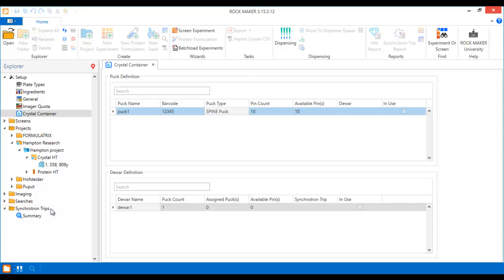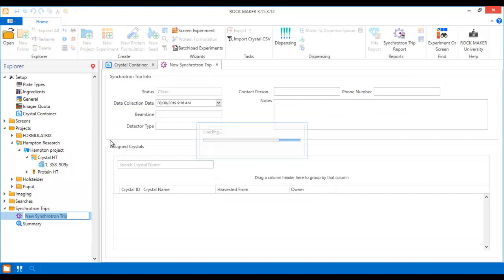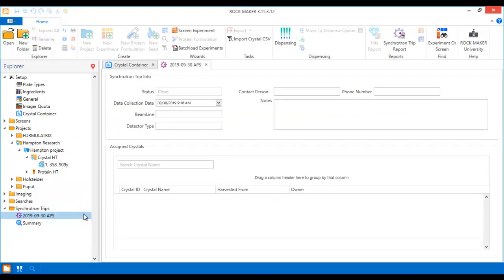To create a new synchrotron trip, right-click the Synchrotron Trips node and select New Synchrotron Trip. You can rename the new synchrotron trip with the name of the synchrotron facility your crystals will be sent to for easier identification.